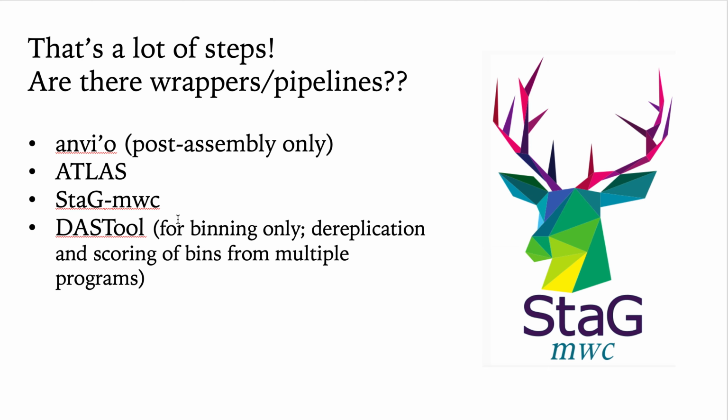So if you're just getting started, again, I encourage you to do every step manually. And this is a really exciting field of research right now, and I have no doubt that there will be more efficient, more automated pipelines that will still allow for some customization down the line, so you don't just need to follow the script provided by the pipeline. But for now, most bioinformaticians, people interested in metagenomes, will do most of these steps manually.